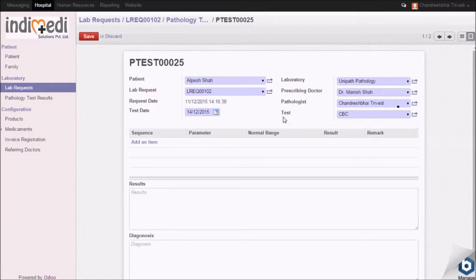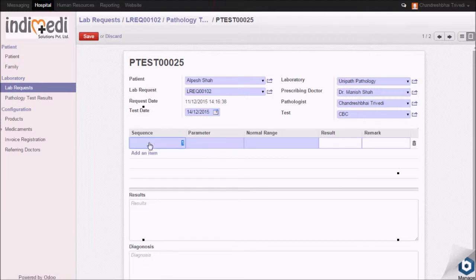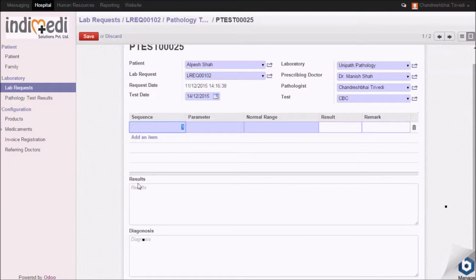To add the lab results, click on add an item. Enter test reports, results, and diagnosis over here.